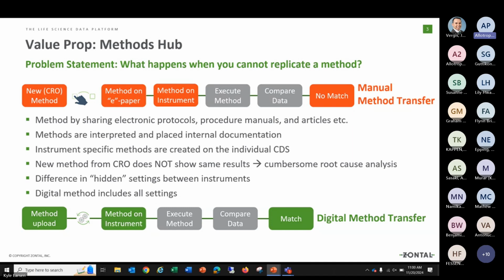All of these things are there because there are some hidden settings of the rather complicated instrument that are just not discussed in that method. So it's just saying, yeah, it's there. And every instrument could be a little bit different. And then you can have, of course, people who know about these and who can change them. That is special knowledge that these specialists have, and then they can run that method. They can make that method work. But this is all taking too long.